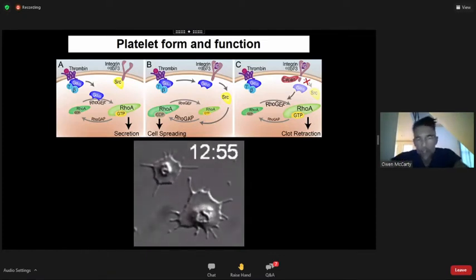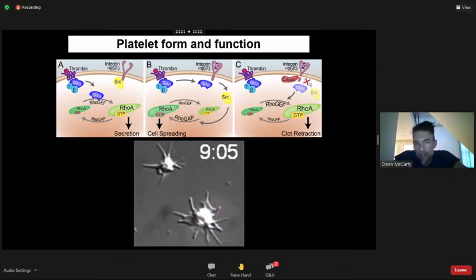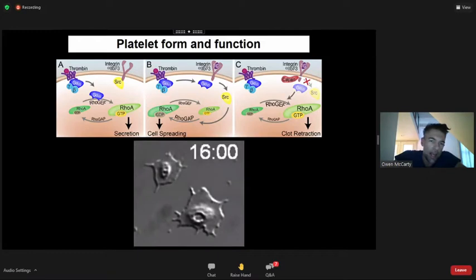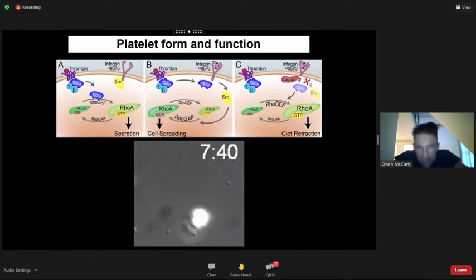Yeah, so here I'm just showing you that one cell that is a platelet. This is the cell that makes these little band-aids. You can see that cell underneath. These are movies I did when I was in England, and I actually was the first person to use this type of microscope to study how a cell changes its shape.